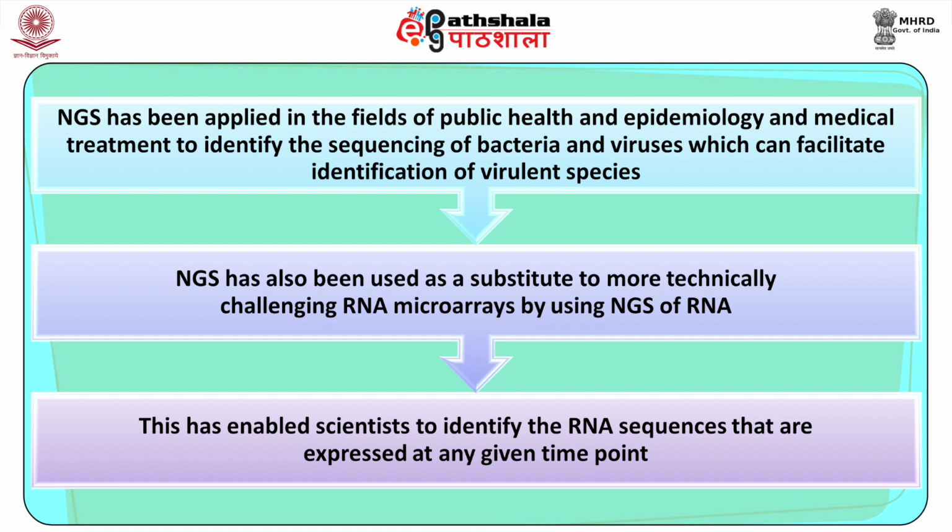It has also been used as a substitute to more technically challenging RNA microarrays by using next generation sequencing of RNA. This has enabled scientists to identify the RNA sequences that are expressed at any given time point.